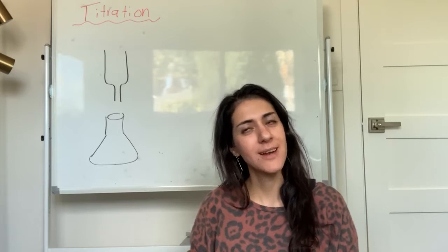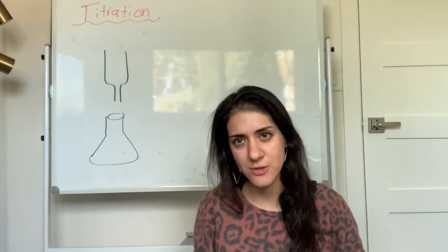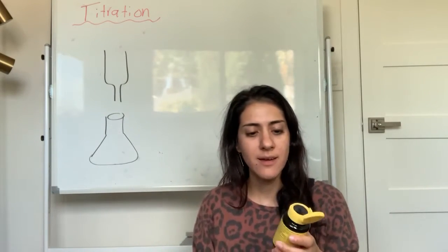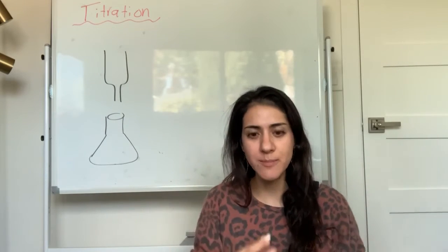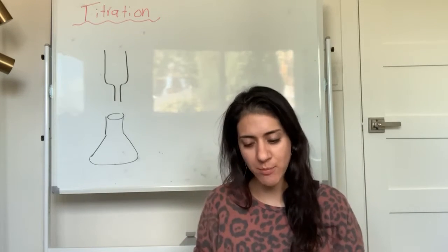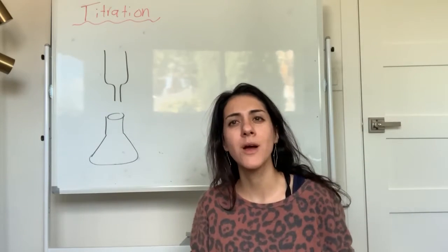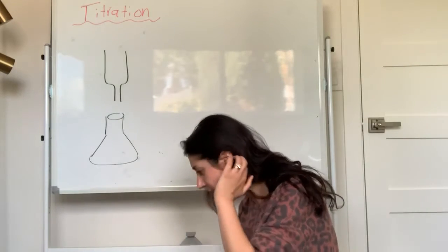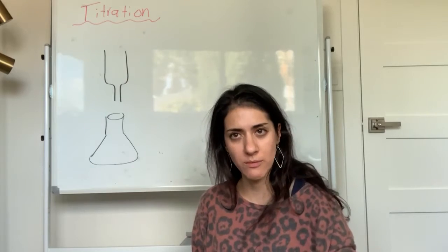Well, to figure that out, you can do acid-base titration, because acid-base titration is a way to figure out how much acid or base you have. And vitamin C is ascorbic acid, so I can do an acid-base titration to figure out how much acid I have in each tablet. Okay, so this is why you have to know acid-base titration is a useful technique.